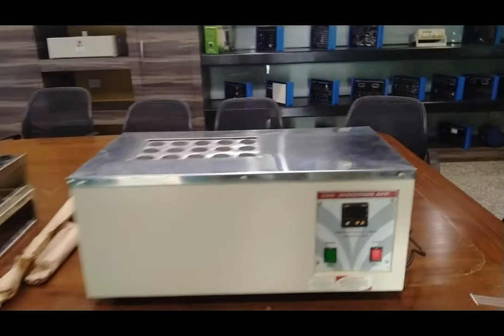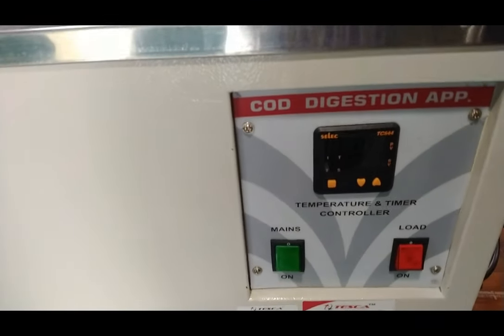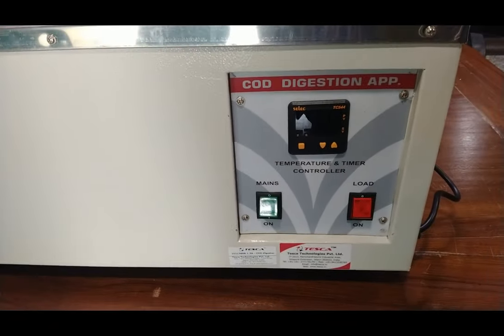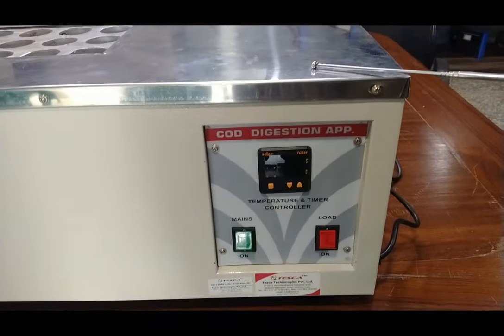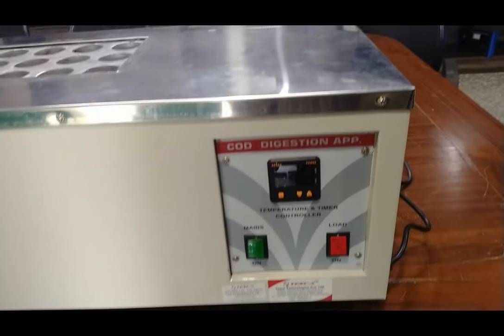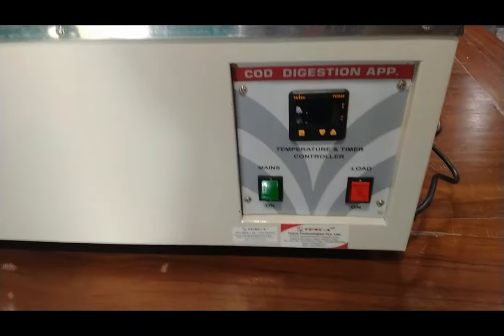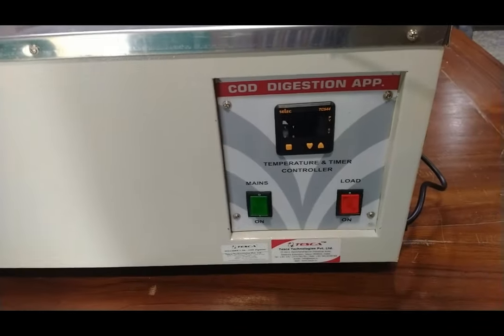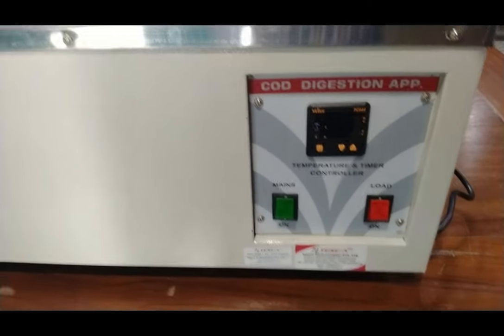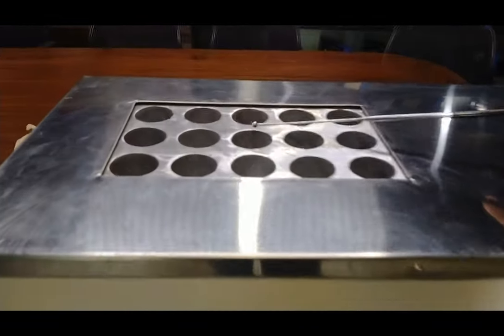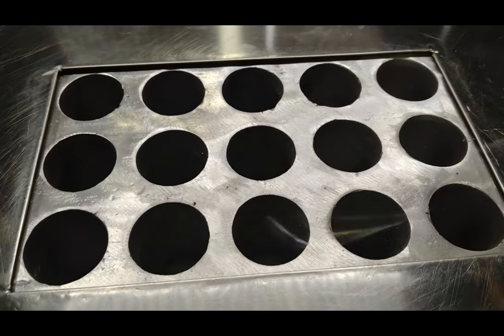A feature of this COD digestion apparatus is that it is easy to use with less maintenance. Digestion of samples is done using potassium dichromate and sulphuric acid. It is designed for digestion of COD test samples with multifunction dry bath heating. The dry block is made up of aluminium with 15 holes, each of 40mm diameter.